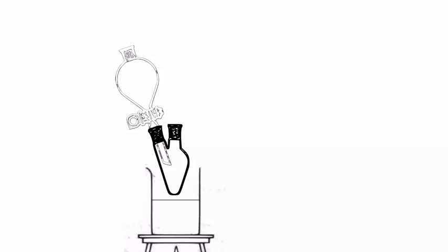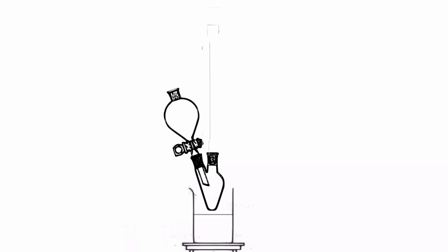I am inserting a tap funnel. This will allow me to add the second reactant and get the reaction underway once I fully assemble the apparatus.